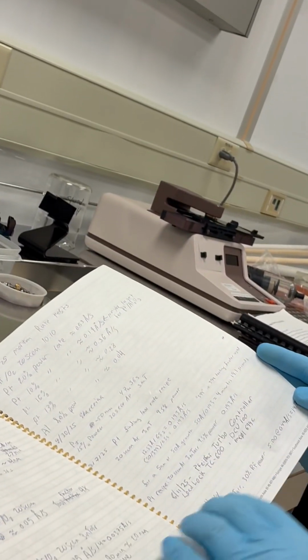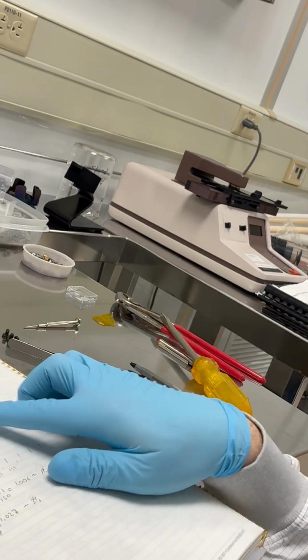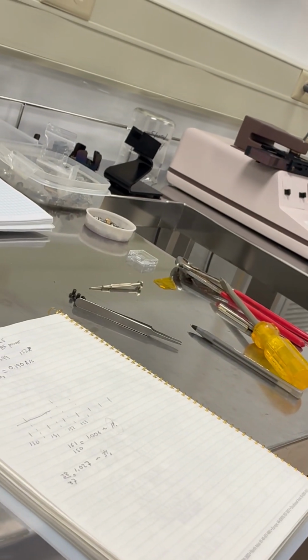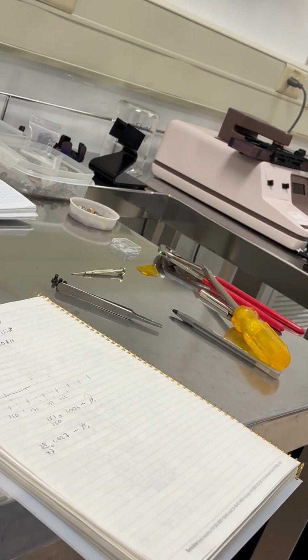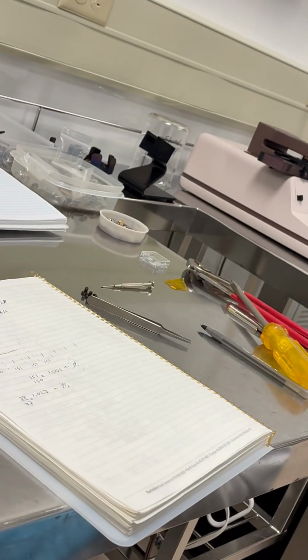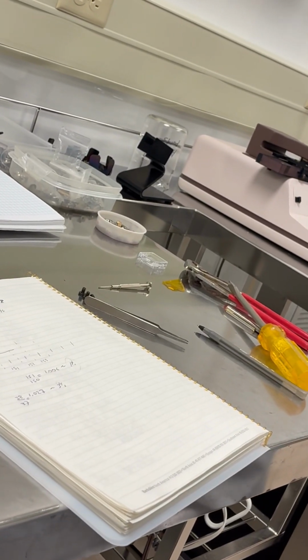In the recipe, I found 193 angstroms, or 0.193 angstroms per second. And I just ran it today, and it was 0.19. It's 3 out of 200, a 1.5% difference. It's not a big deal, right? Because the QCM only really has about 10% accuracy to begin with.